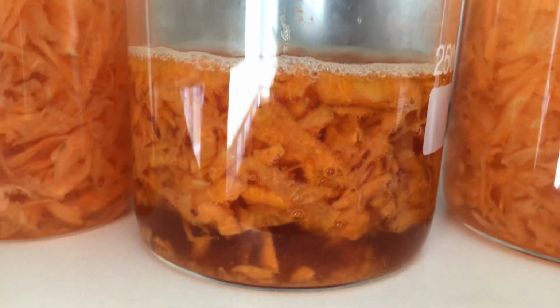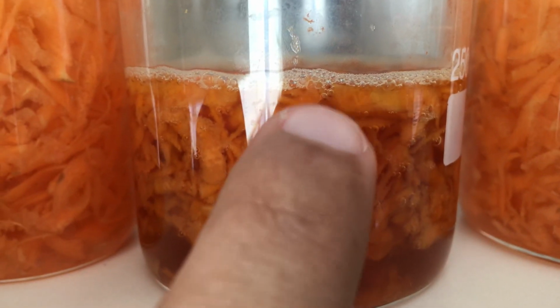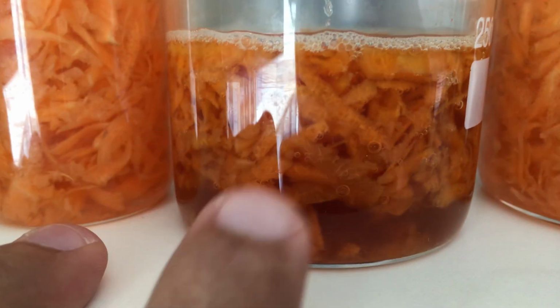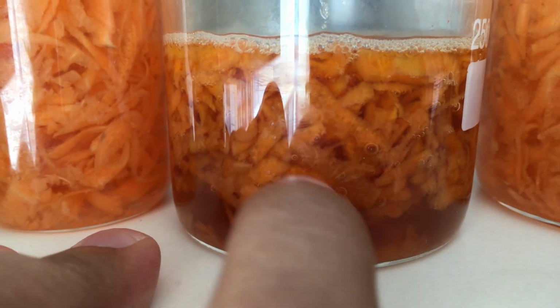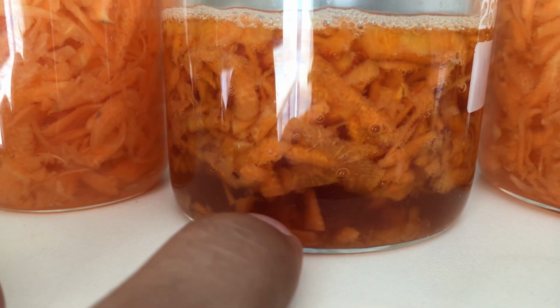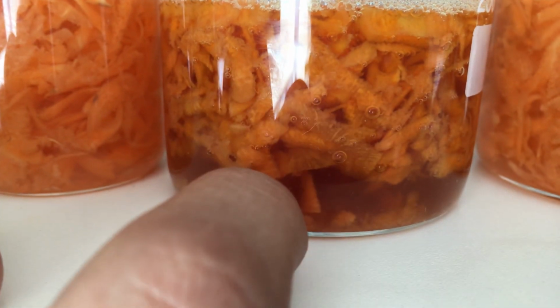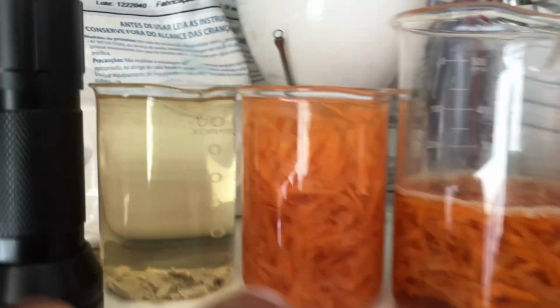but something that didn't happen to the others is it seems to be fermenting. You can see the bubbles, most likely it's CO2. And I assume, since the tea is not purified, the excess fructose and glucose and the other sugars in the cappy are fermenting with the carrot, and it's causing the fermentation to start.